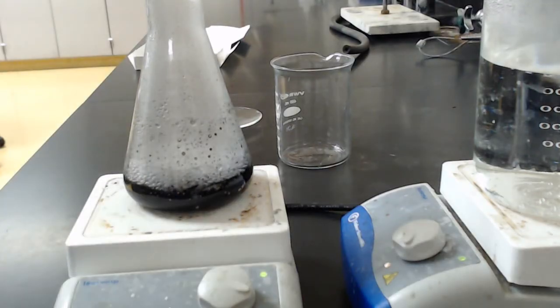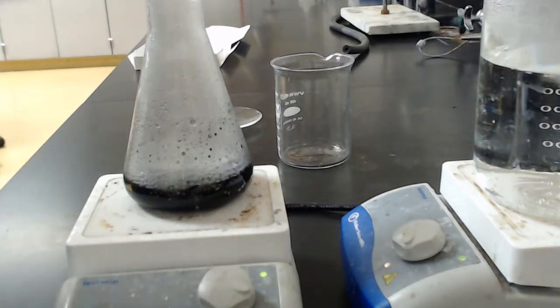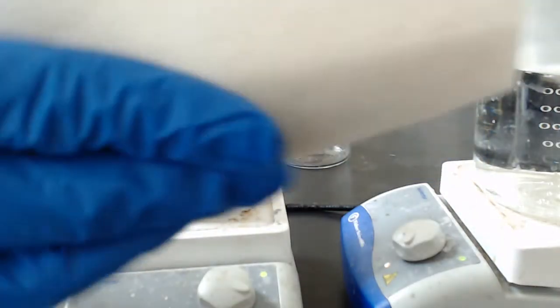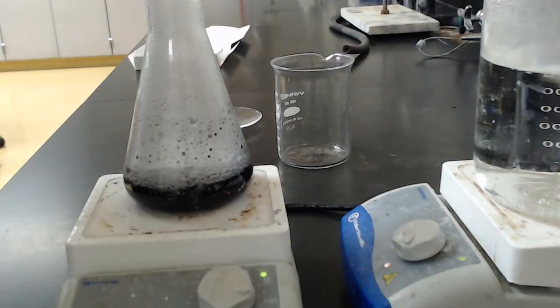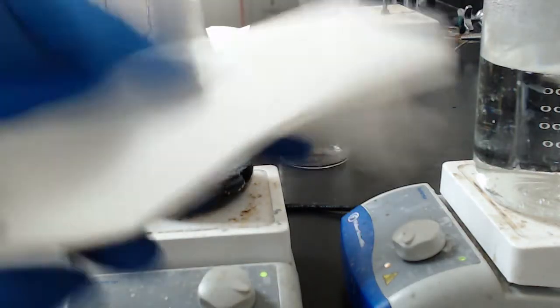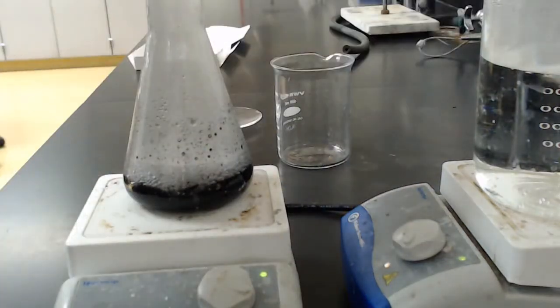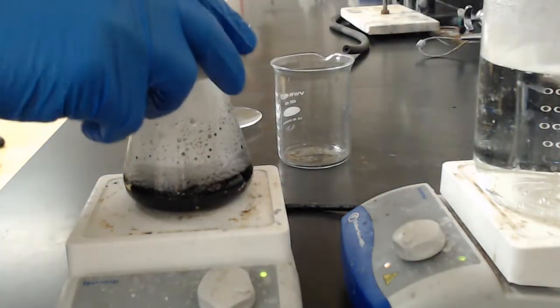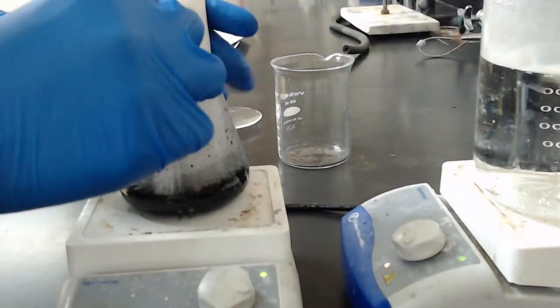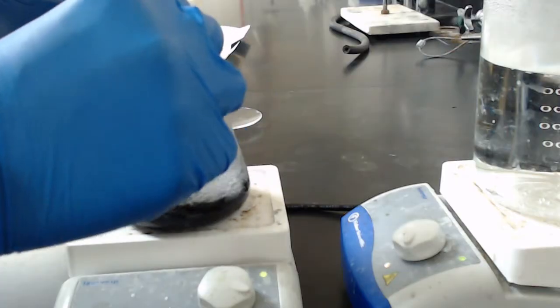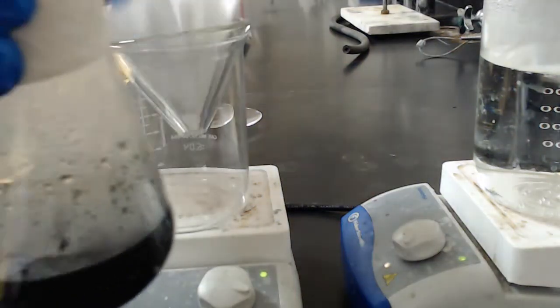For this part here, you got to be careful with the hot glass. I recommend that you basically take a paper towel and you fold it in half long ways like this. And then I'm going to make this into a little handle. All right. And that's the part you want to be quick. Don't let it cool off early.